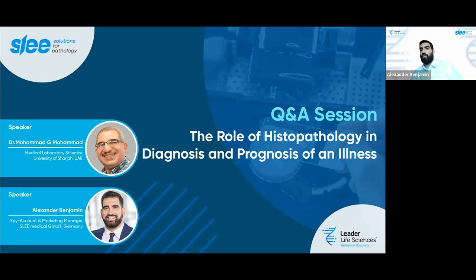So, unfortunately, I cannot say more about microscopes because we don't provide microscopes. But up to the point that the section will reach the microscope, it's really determined by every step in the process. So, the tissue processing in the beginning has to be done correctly. So the orientation throughout embedding has to be correct in order to be able to section the tissue in the proper way.